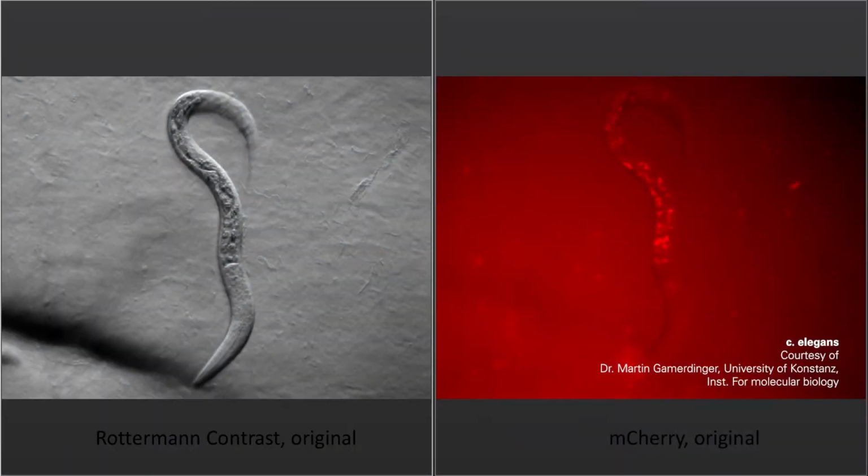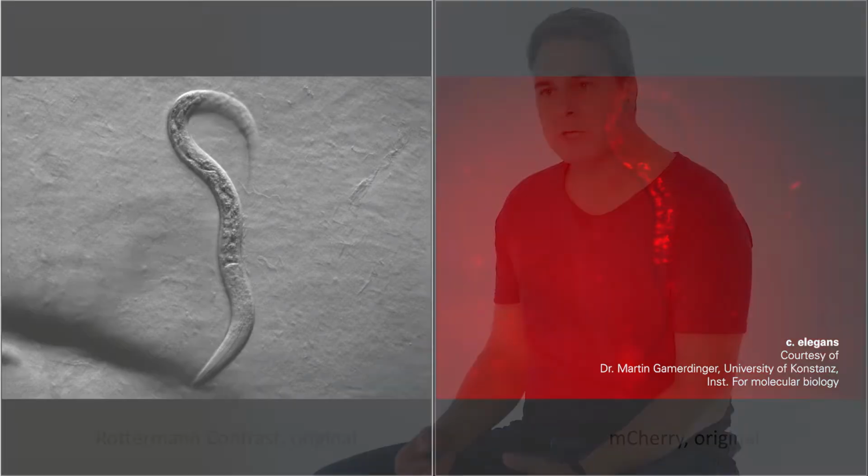complex models. So typically you have to inject, you have to breed, you have to screen and characterize to find the right line for your purpose. The downside, generating those transgenic lines is simply a tedious process. Screening and sorting is usually done under a stereo microscope because you want to go quickly through your dish and you want to pick the right organism for downstream analysis.